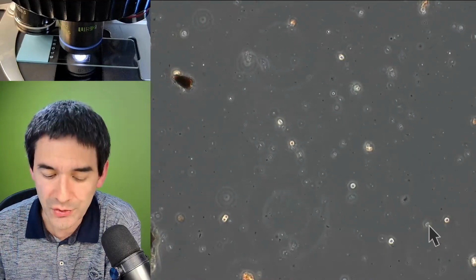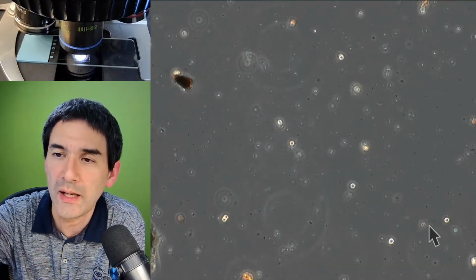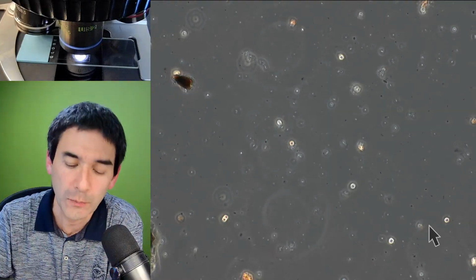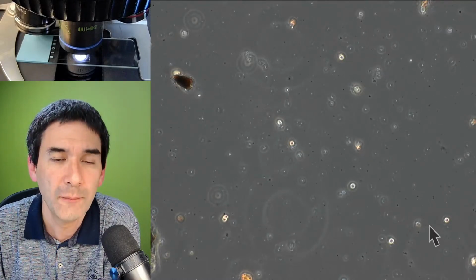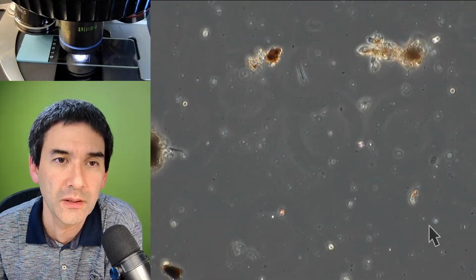So what I've also done is the following. This here, I added some water to it maybe an hour or 2 hours ago, to allow the microorganisms to regenerate a little bit. And the soil was not completely dried either. If you actually completely dry the soil, then of course many microorganisms are going to die off. But those that are able to form spores are able to survive. So this could indeed be a case.